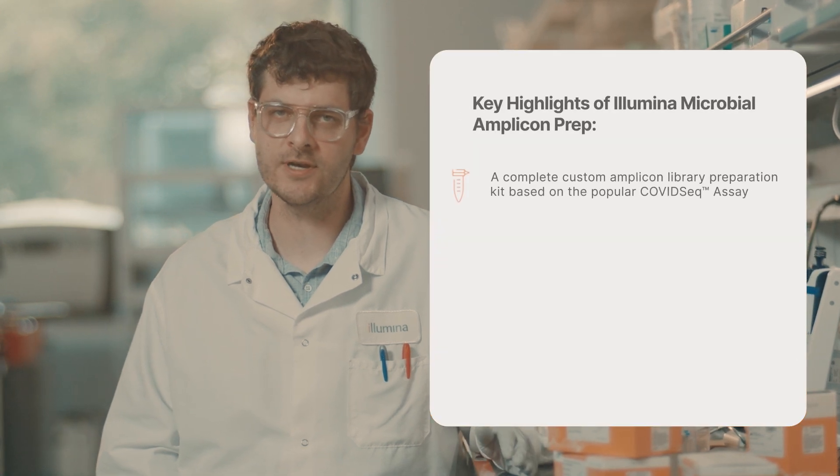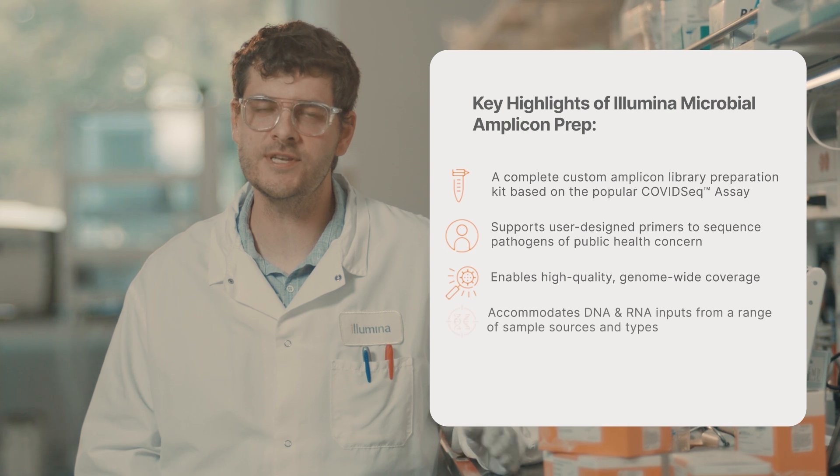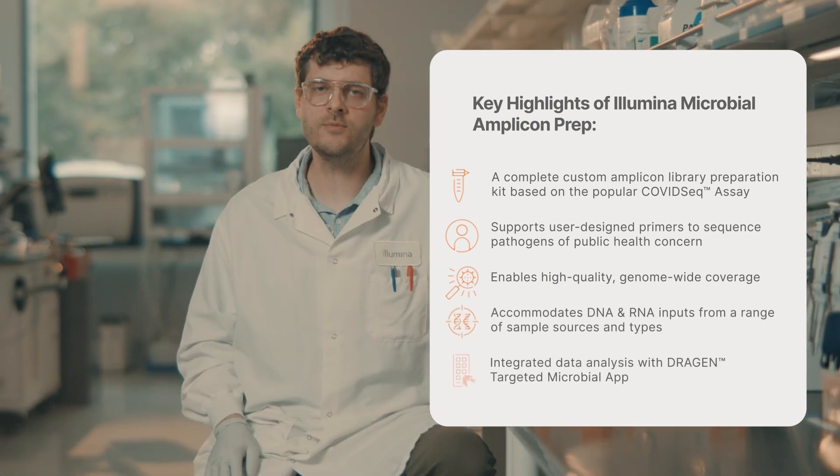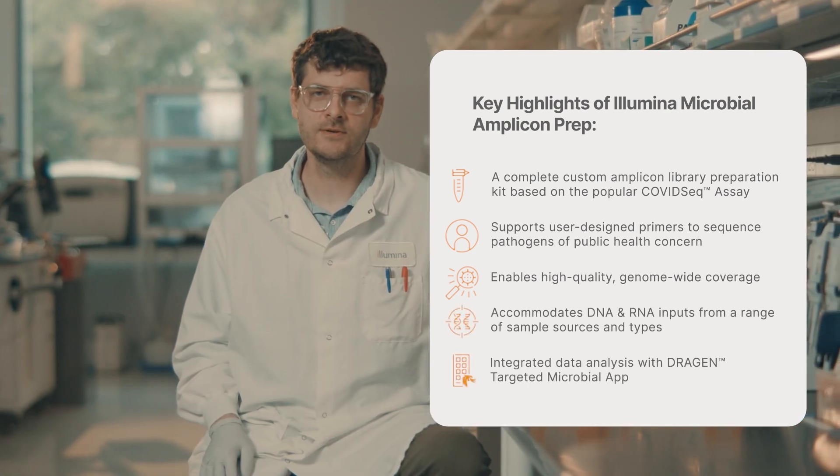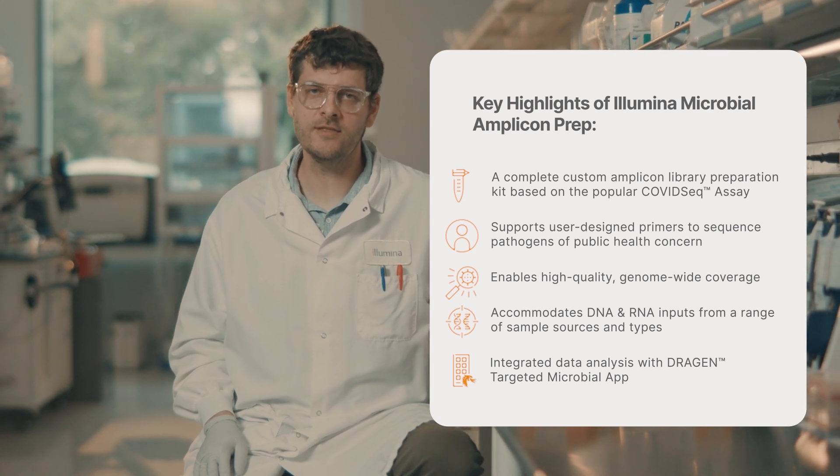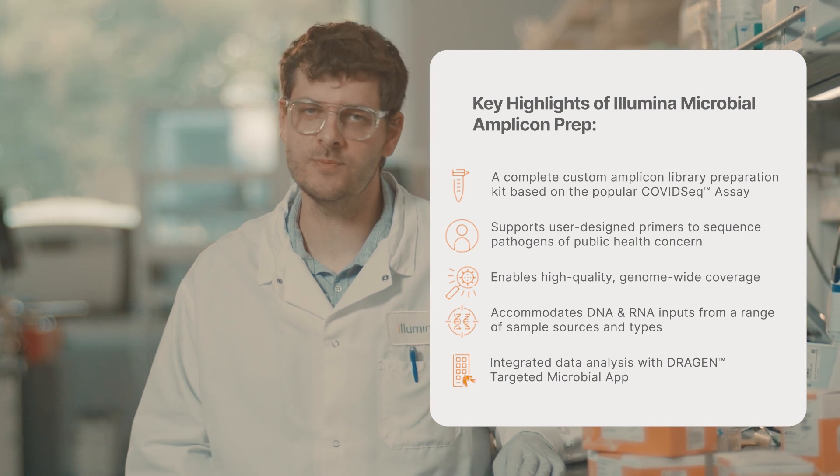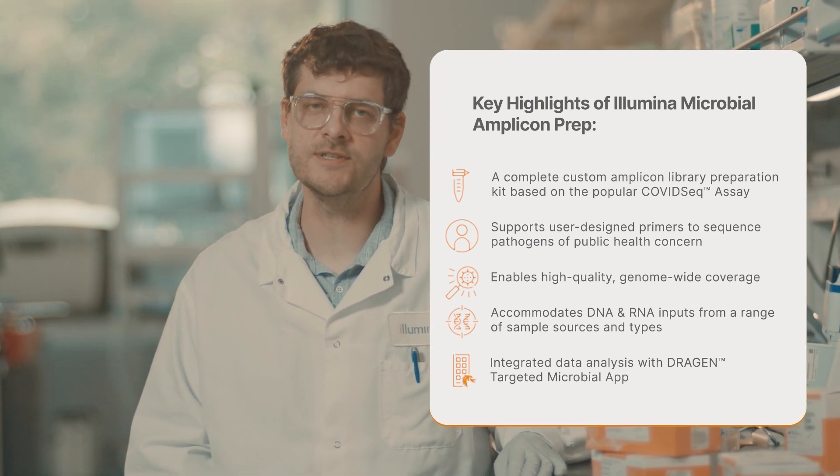Once our primer pools have been designed and diluted to working concentration, and our samples have been extracted, we can proceed with cDNA synthesis. Then we tagment our amplicons and add index primers, which amplify the fragments further. Finally, we clean up these libraries using Illumina purification beads, and then we can proceed to sequencing.